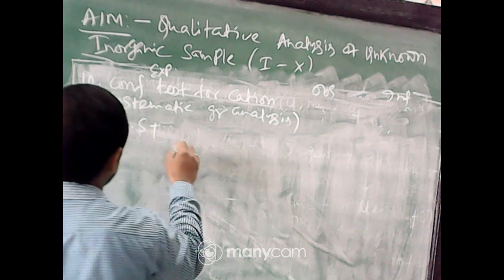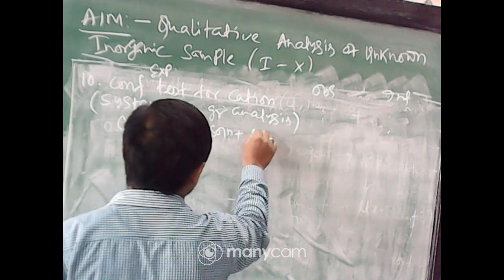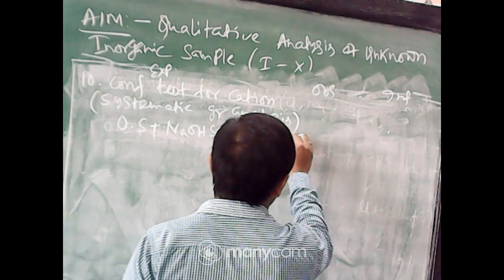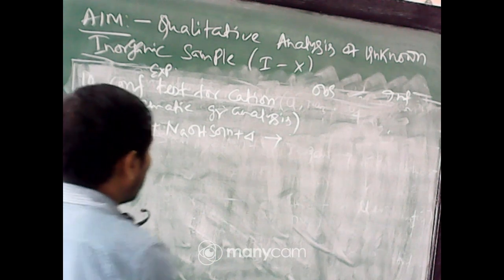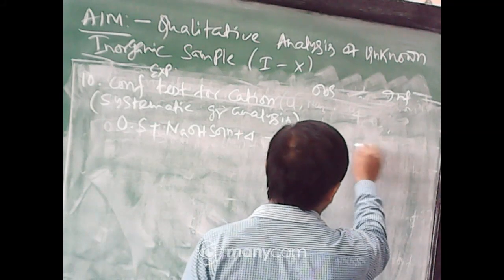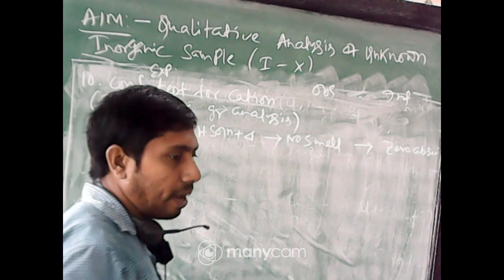OS plus NaOH solution plus heat. If the smell of ammonia comes, then group 0 is present. No smell, group 0 absent.